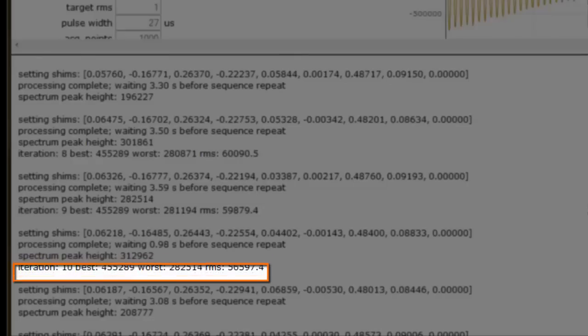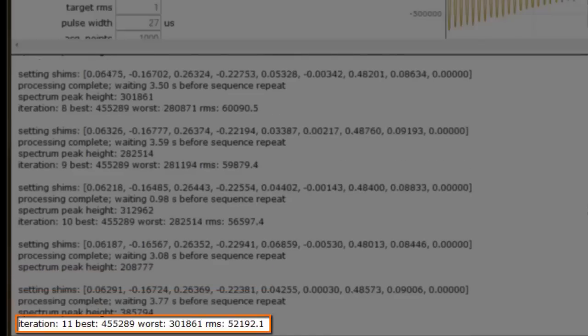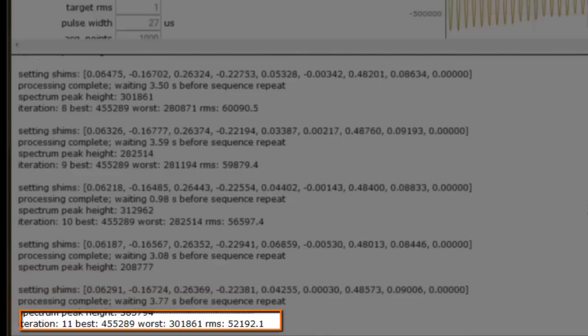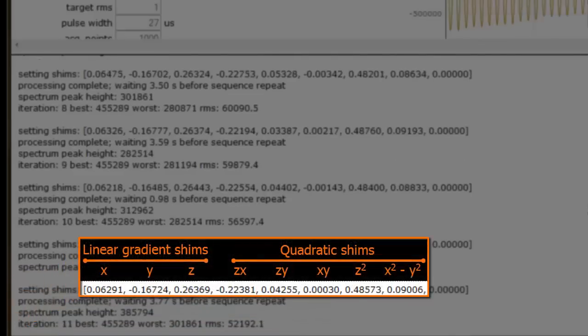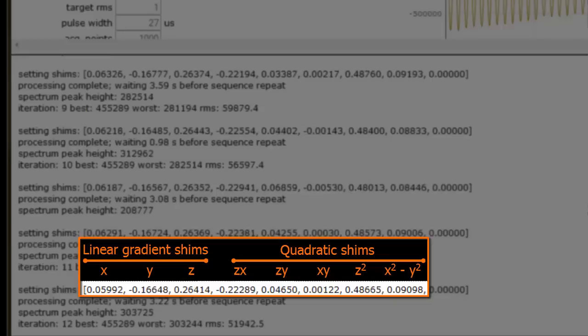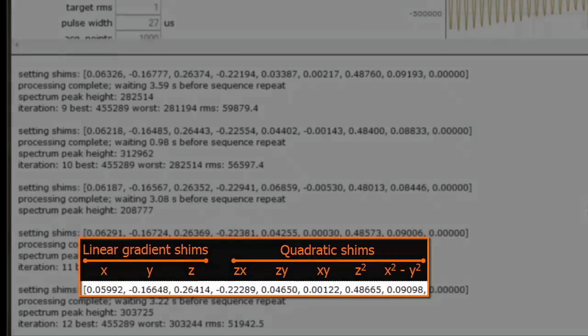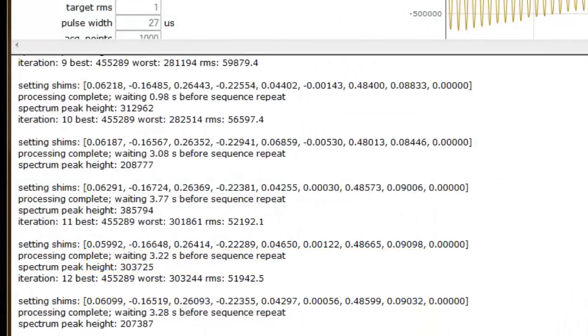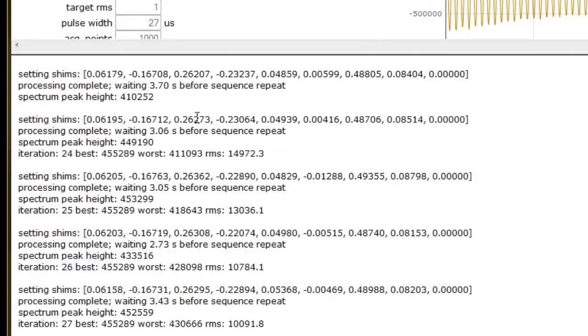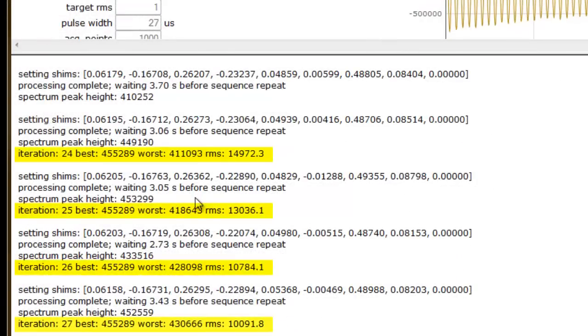When we perform a full shim, we optimize the three linear and five quadratic shim coils, and for any given iteration of the simplex algorithm, there are up to eight possible coil adjustments, or cycles. However, on average there are approximately 2.5 cycles per iteration. You can see an example of this behavior between iterations 24 and 27, where only one coil adjustment per iteration was made.